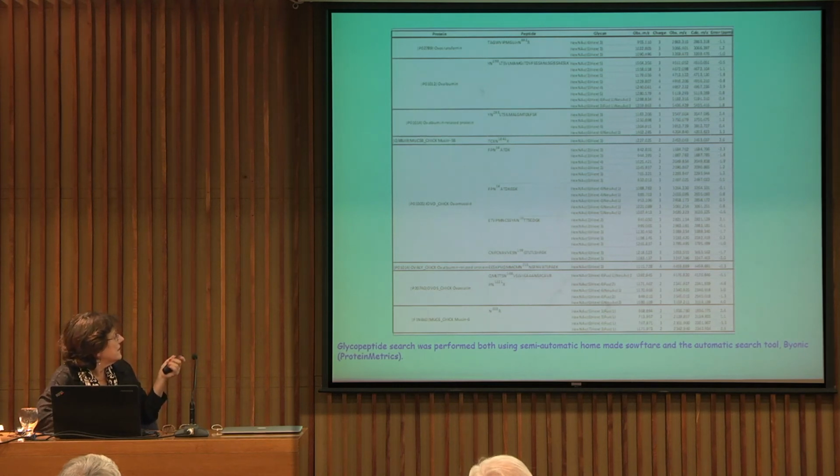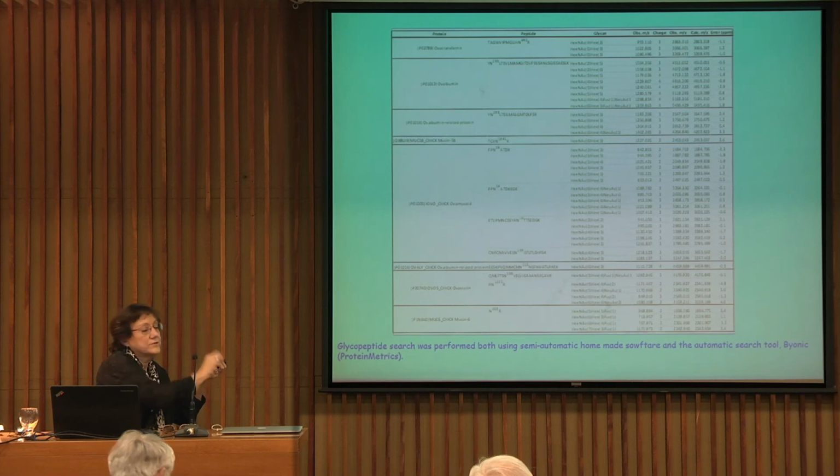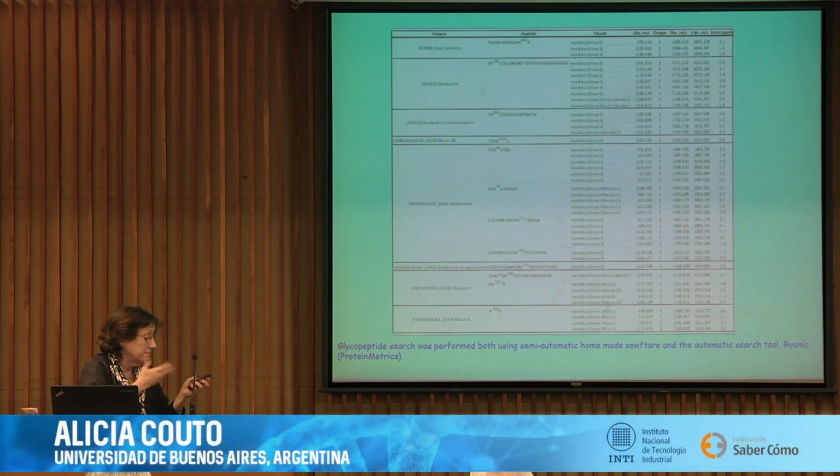As we had determined in the whole proteomic pool the different glycoproteins, we wanted to know if in this whole study we could lose some details referring to the isolated proteins. One type of analysis is to isolate the protein, for example in the SDS-PAGE, and study that protein, and on the other side we took all the proteins and studied all the glycoproteins in a batch.